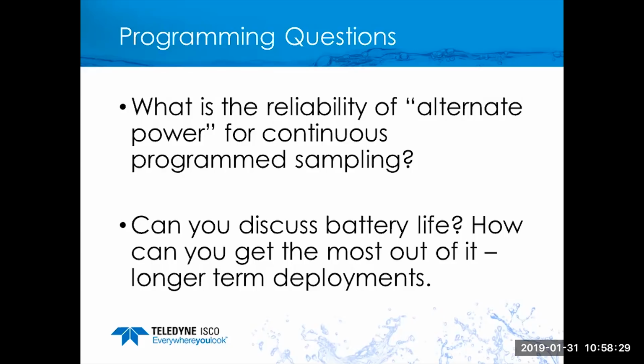More power than you've actually needed is always preferred over not enough power. But even then, if you go with a big marine battery, your configuration settings have a huge impact on power. So make those decisions very carefully. If the deployment is more permanent in nature, you might want to have a solar panel in the mix to make sure that the battery charge is maintained at all times.